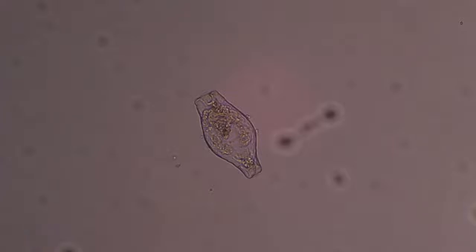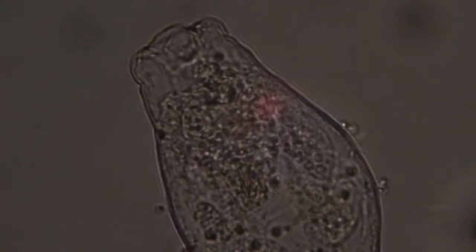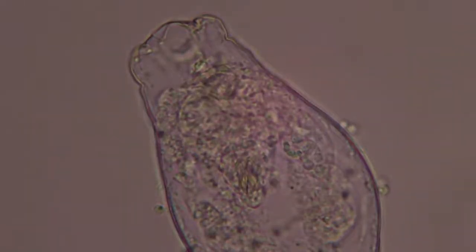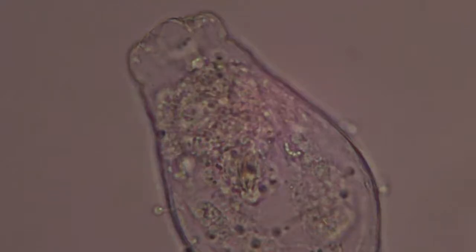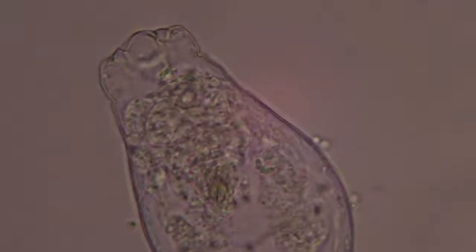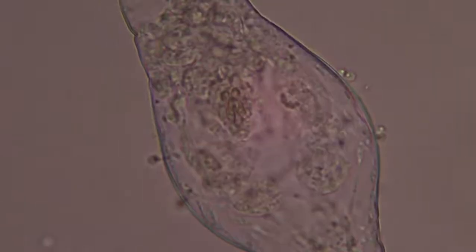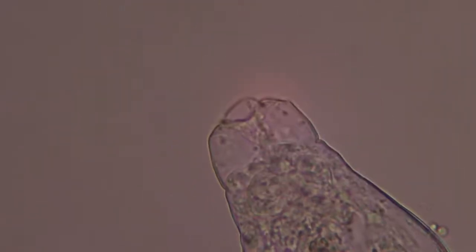See if there's any activity inside of it. Yeah, absolutely nothing. There's the mouth part. This is the tail section that's retracted. Pretty amazing how they can telescope their body into a little compact shape and then stretch it out. Requiem for a rotifer.